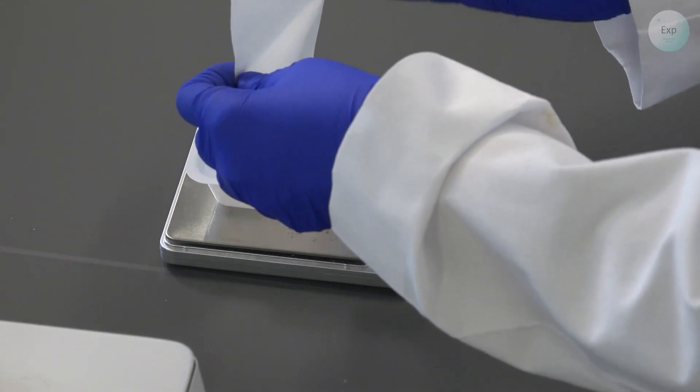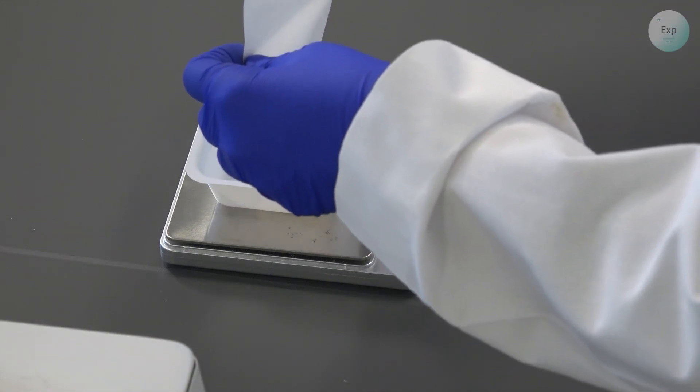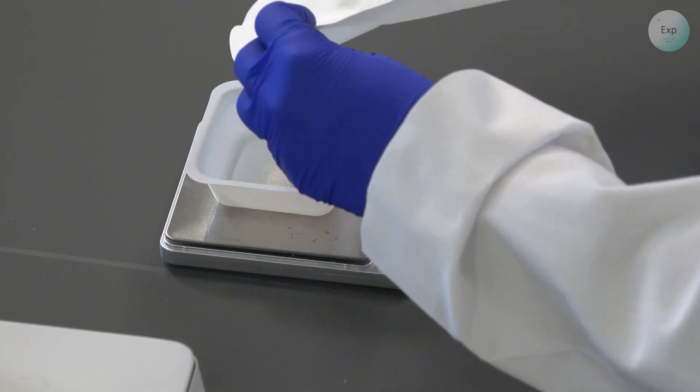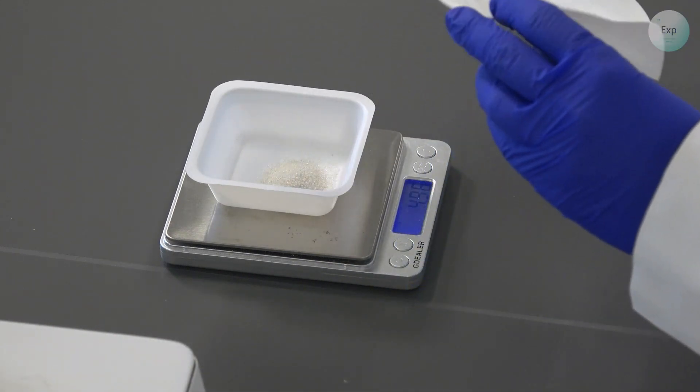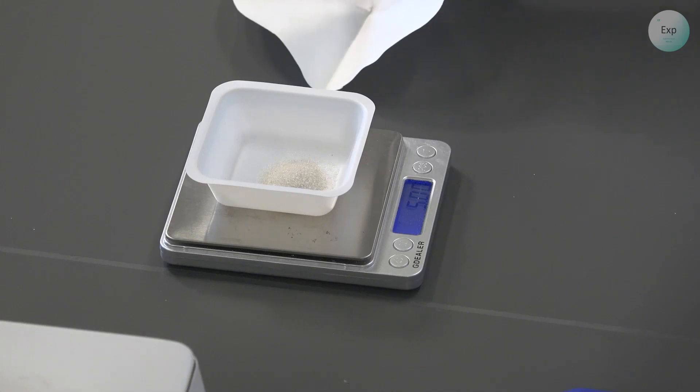If we did a good job, then the sand should very easily let go of the paper and should find itself in the weighing boat. There are probably some very fine sand particles stuck to the paper, but we expect some loss. Still, our recovered mass for the sand is 5.06 grams.